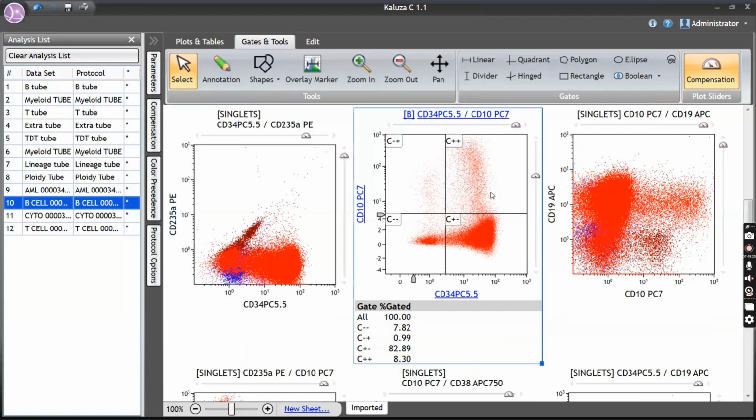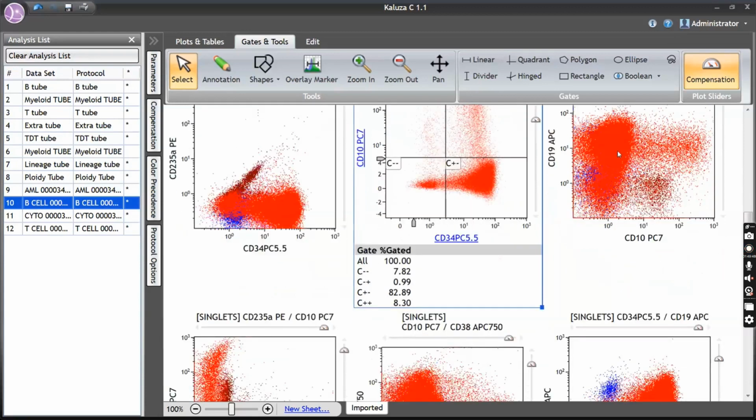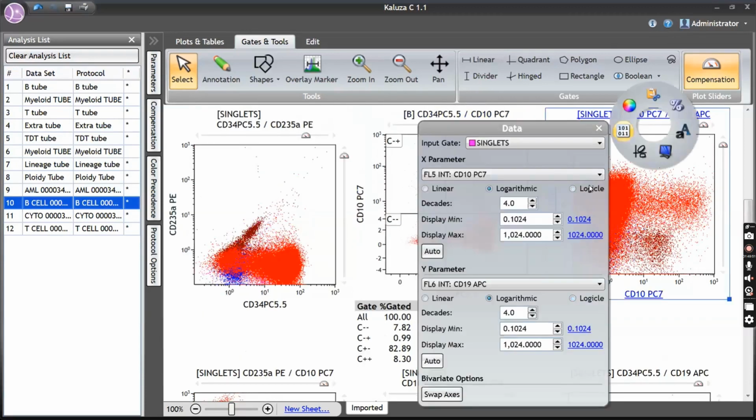Because once it happens, see, there was a case where it was reversed, where 95% was CD10 positive and there was some 3% which was CD10 negative. So it was ignored some 4 or 5 years back. And when there was a relapse, the complete blast was CD10 negative, accounting for 90%, because this CD10 negative blast was a clone which had relapsed. So I would suggest you put it in the report. It would be useful. Okay.